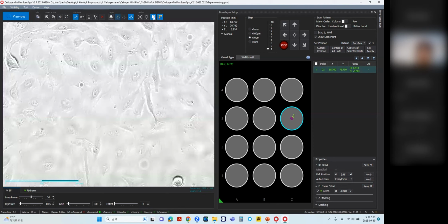We also do have a fan here. Right now, I'm not sure if you could hear it, but it's on, now it's off. And the fan is actually just there. So as it operates inside the incubator, a lot of people are sometimes concerned if the device itself creates any heat or affects the humidity or temperature inside the incubator.